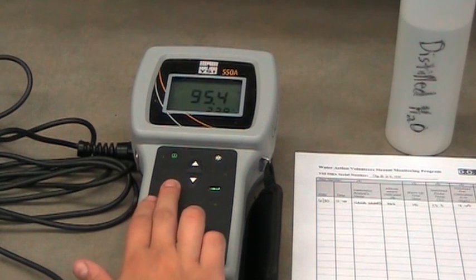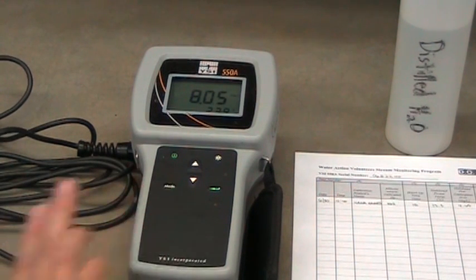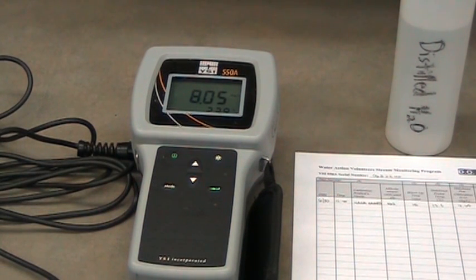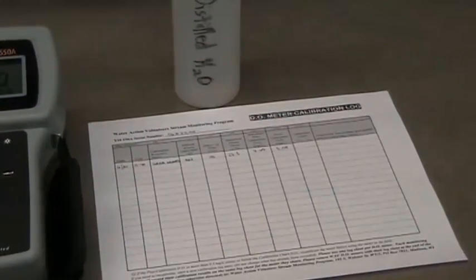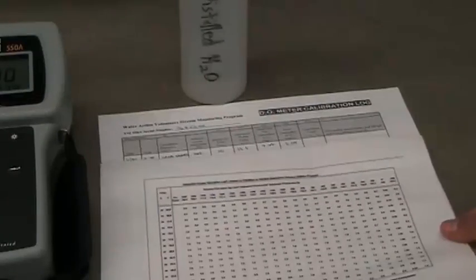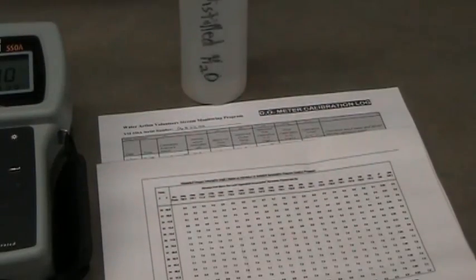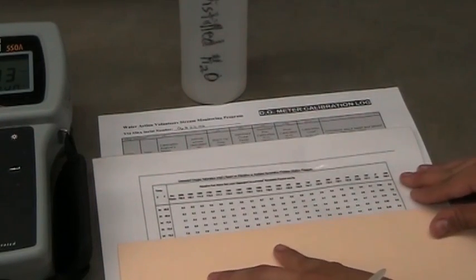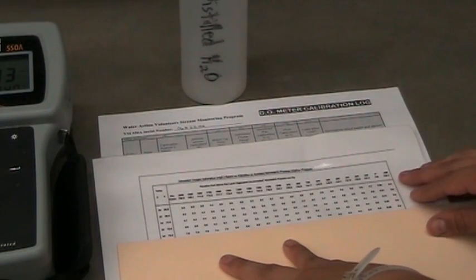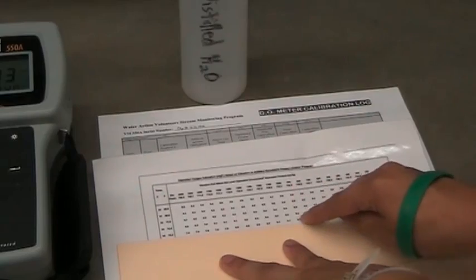Press mode to toggle to milligrams per liter and record the post-calibration dissolved oxygen on your calibration log. Look up the calibration dissolved oxygen value on the table included with your meter. Find the probe temperature and your current altitude on the chart and record the corresponding dissolved oxygen value on your data sheet.